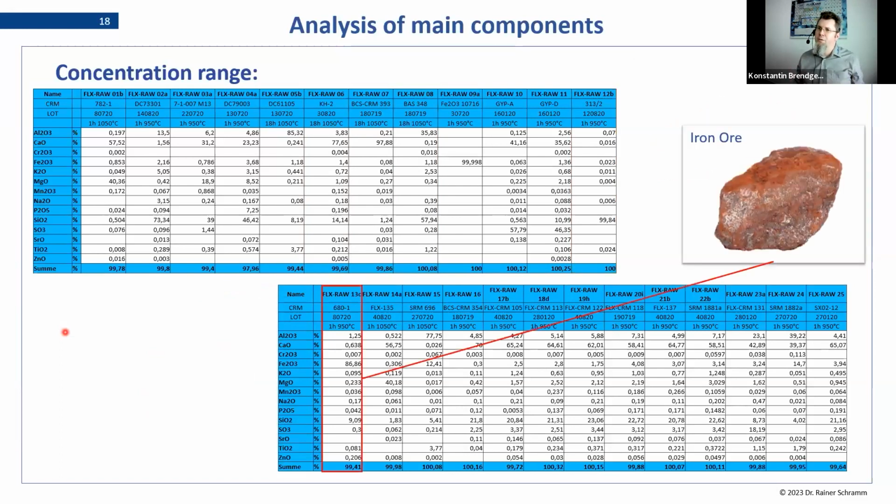So the raw material already takes all these CRMs that are available, all these mineralic CRMs, and puts them into one measurement program, which again only works in terms of analysis performance on fused beads, because you're eliminating the matrix effects, you're destroying the mineralogy, and you basically have the fused bead in the end.